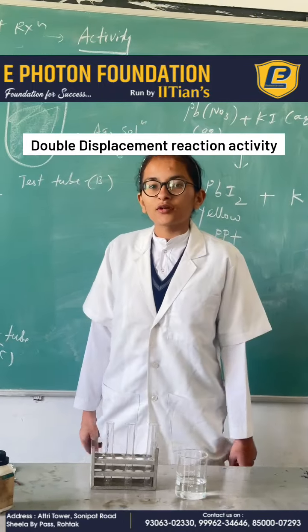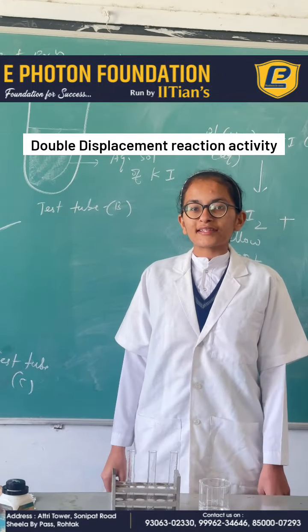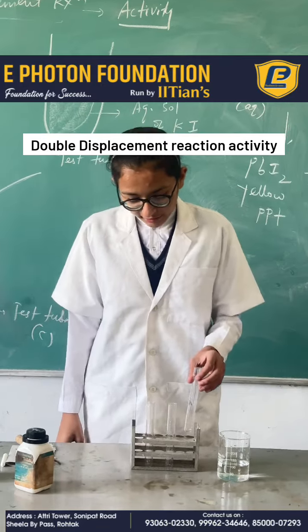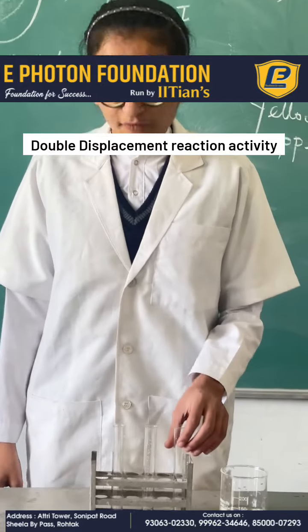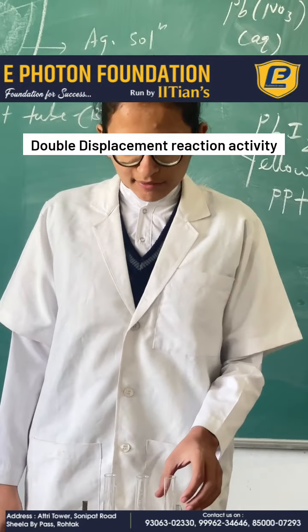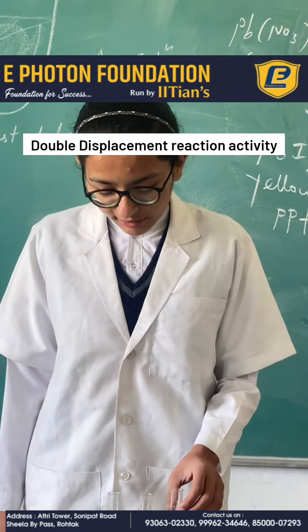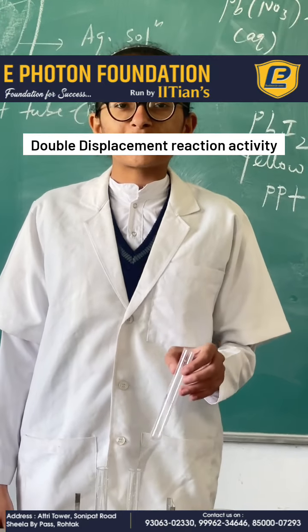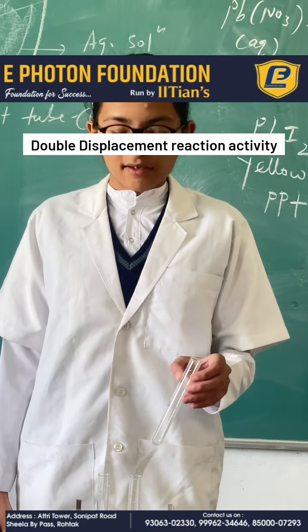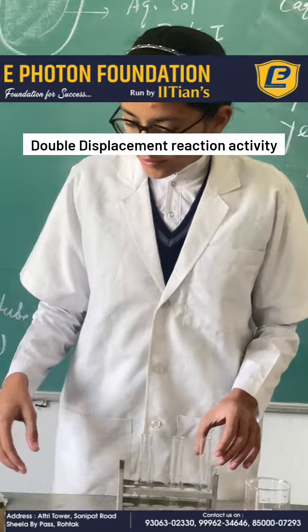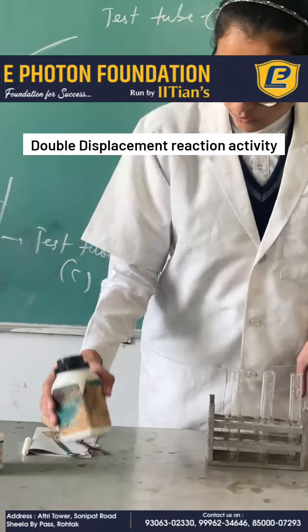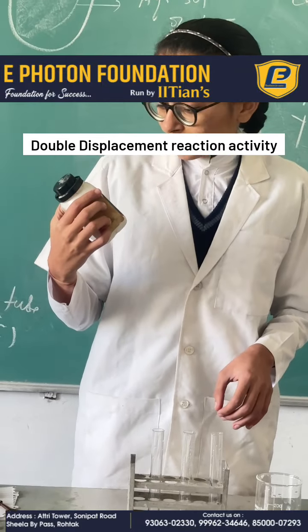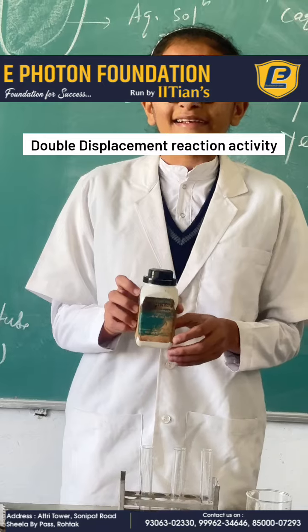So now we are doing this activity. First of all we take 3 test tubes and mark these with A, B, and C. This is test tube A. In it we add some amount of lead nitrate.